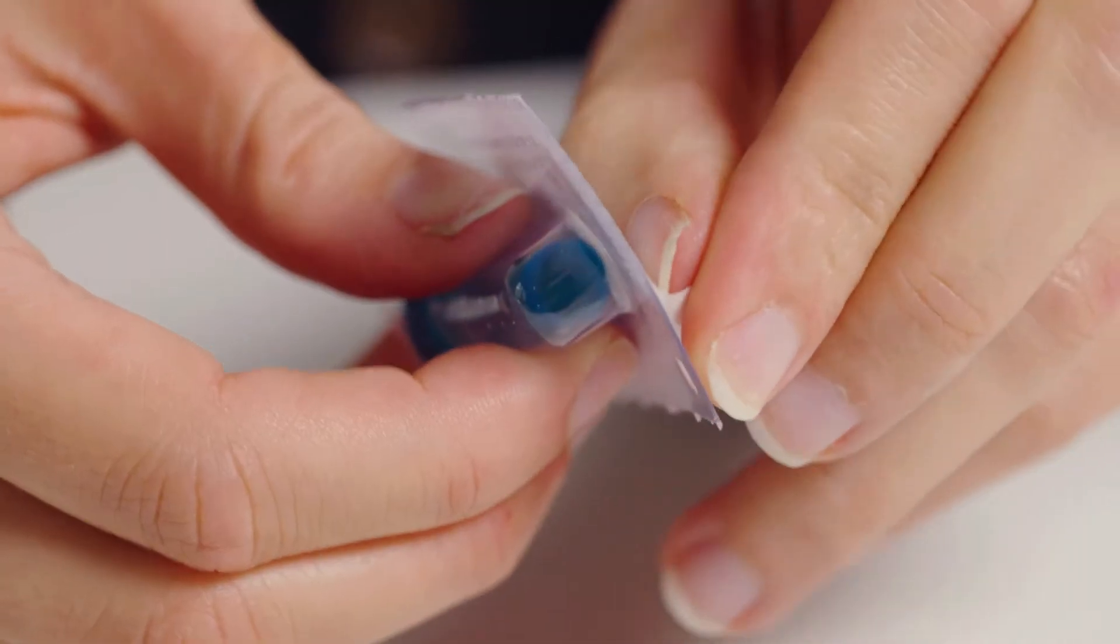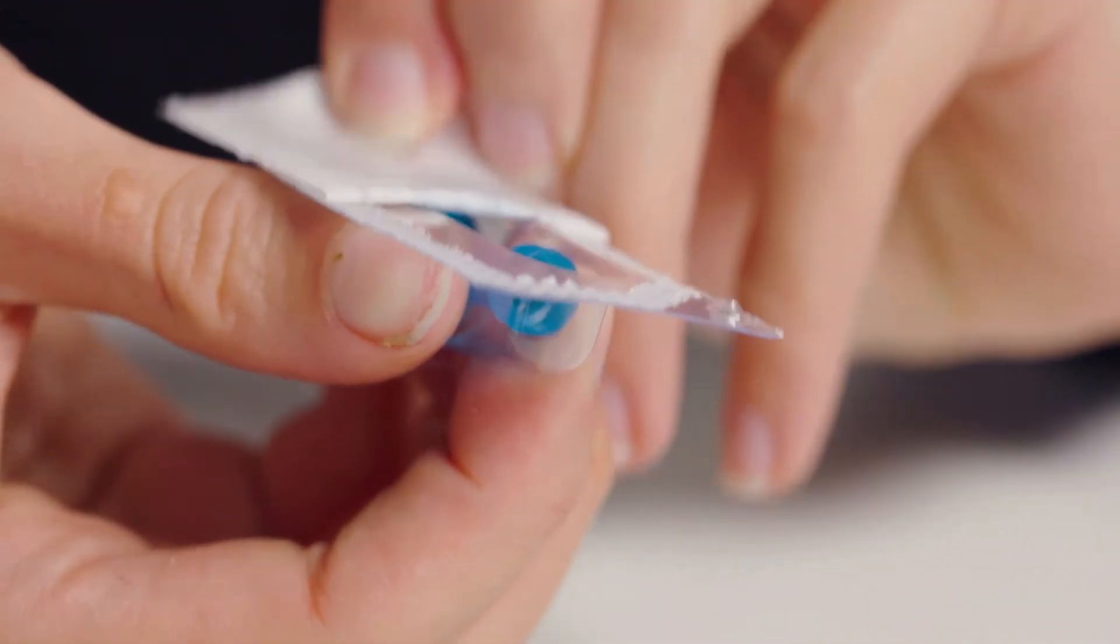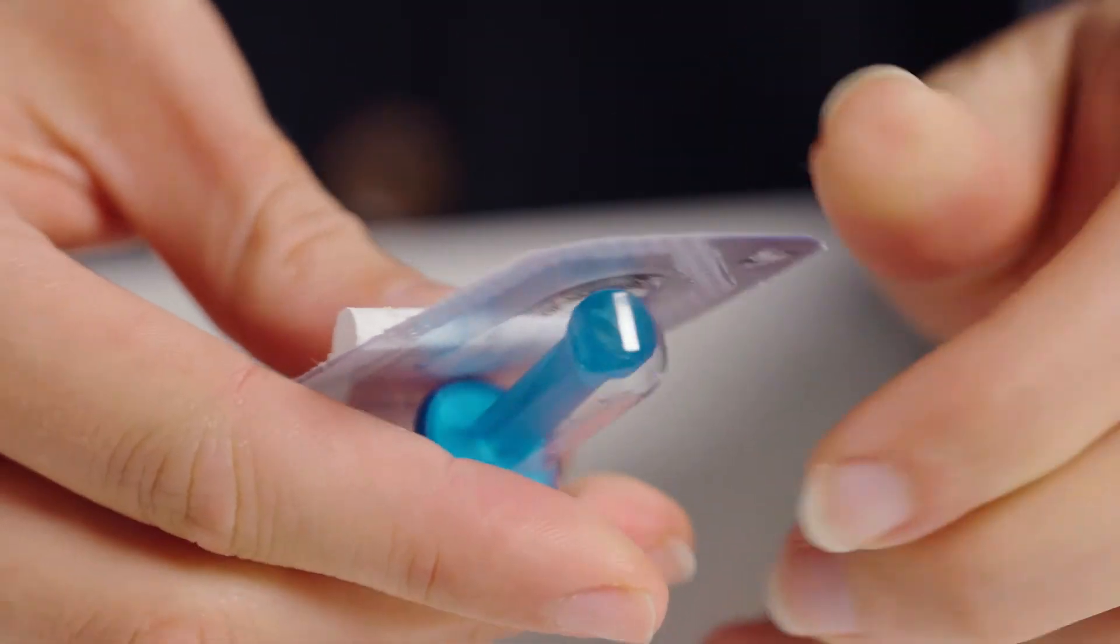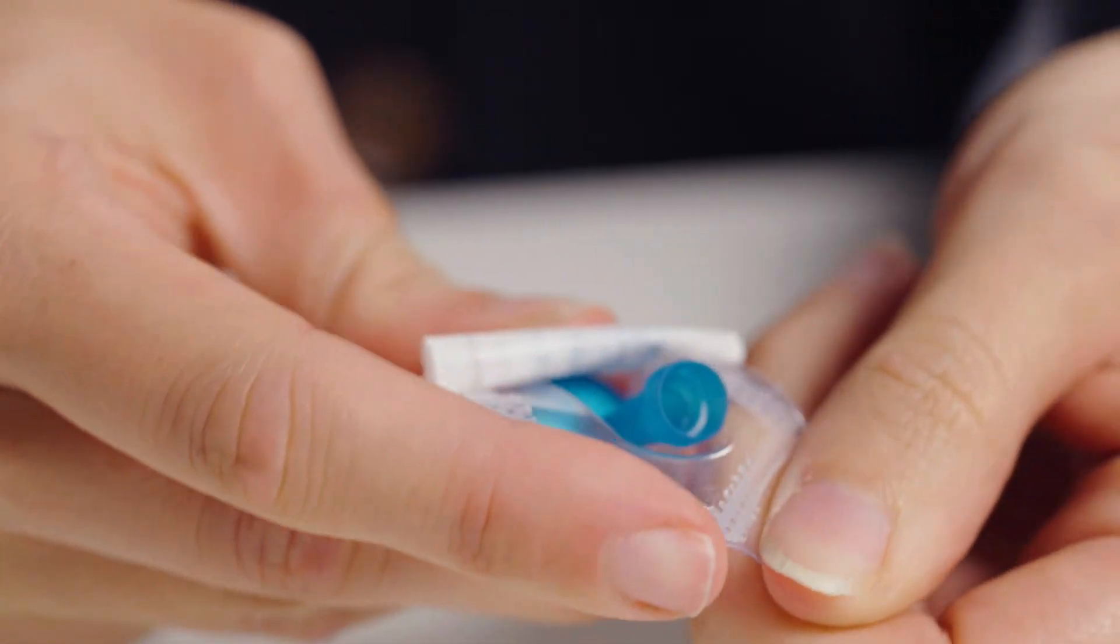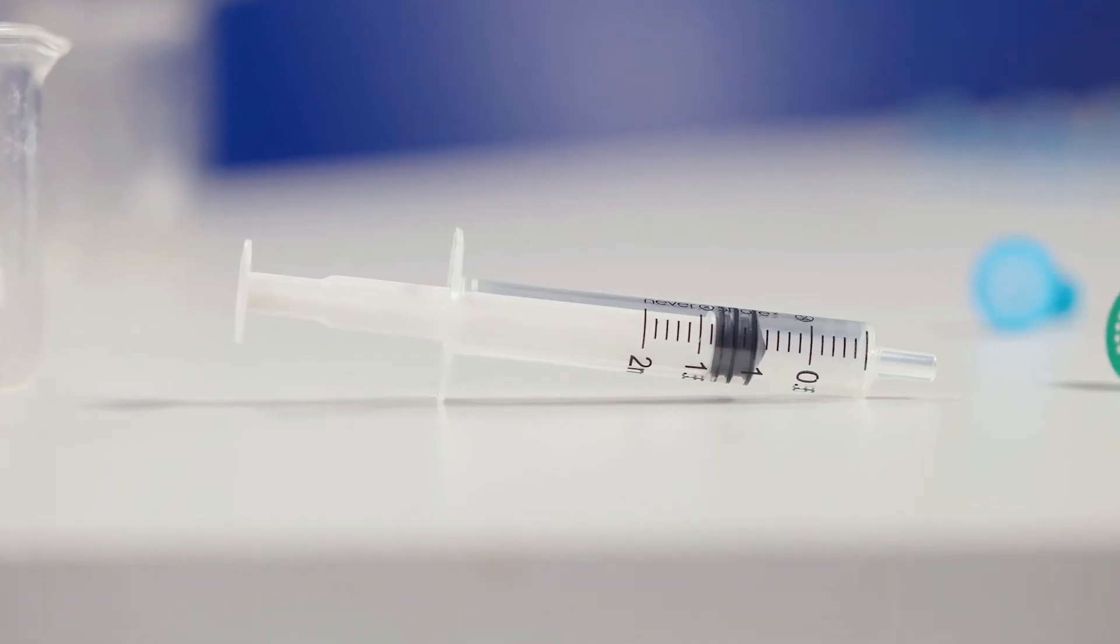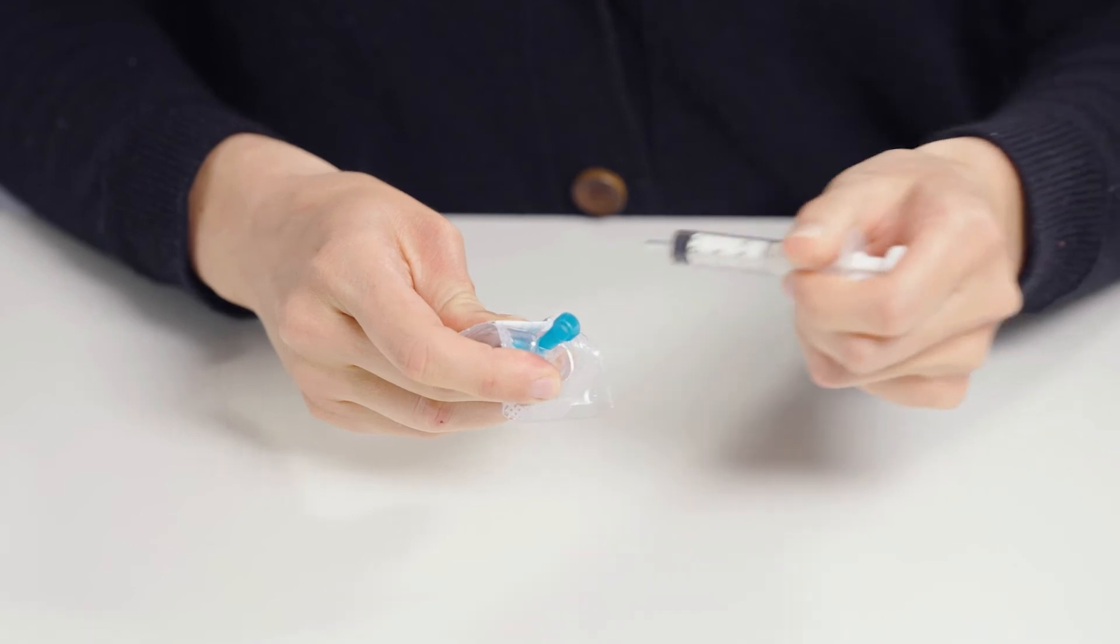SteriFilt comes in sterile packaging. To use, gently remove the paper lid, then tilt the SteriFilt while making sure not to touch it directly with your fingers. It is important to always avoid touching the filter to prevent contamination with bacteria on your hands.